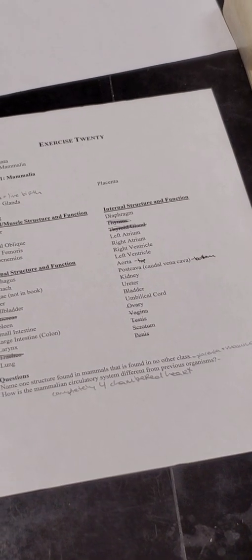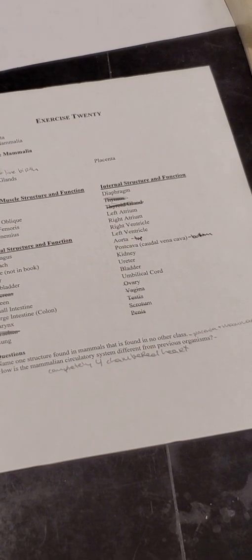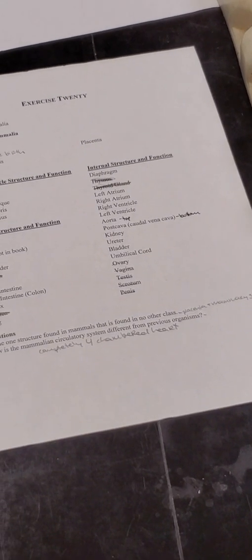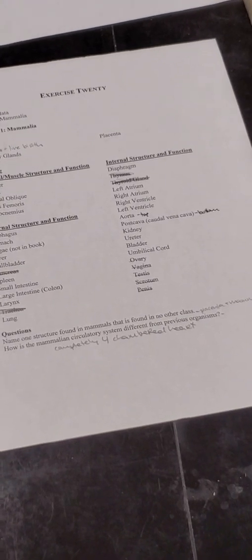Ovary, vagina, testes, scrotum, penis, you guys can mark off. I'm not going to ask about those. So one structure found in mammals that's found in no other class: mammary glands. And placenta. And then how is the mammalian circulatory system different from previous organisms? Exactly.